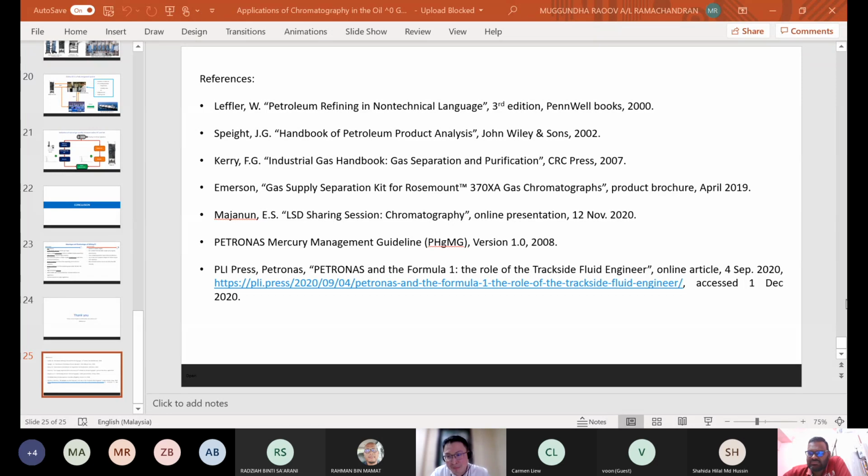Most of the time when we collect the samples, let's say for example from an offshore facility, on top of having online GC or online systems at the refinery, there are multitudes of tests that we collect on a day-to-day basis from an offshore platform. For example, we check density, pH, composition, and a lot of other tests. So when we collect the samples, to a certain extent, we have some prior knowledge that from this particular sampling point or area, the contaminant might be high.